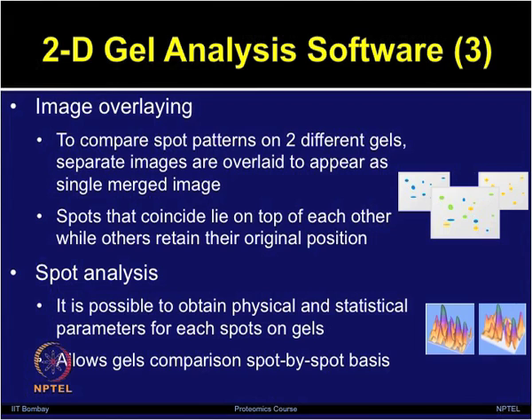Often, running a gel or acquiring images and generating a lot of data is much more straightforward as compared to doing the analysis, which is the more tedious step. One has to really sit and go through the gels, usually spot by spot, to analyze them.